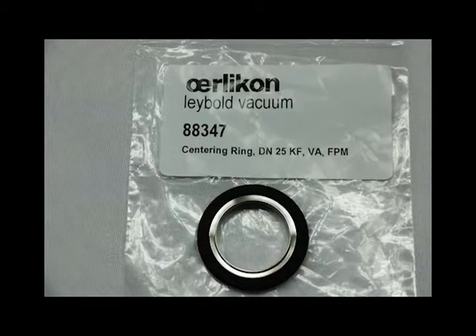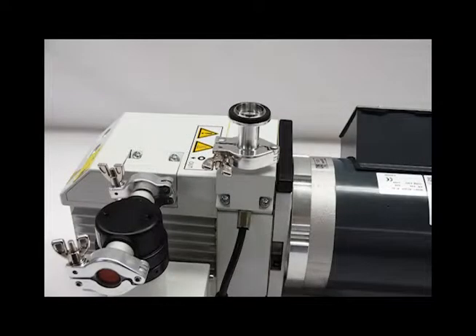Place the DN25 centering ring, part number 88347, on the free end of the reducer.